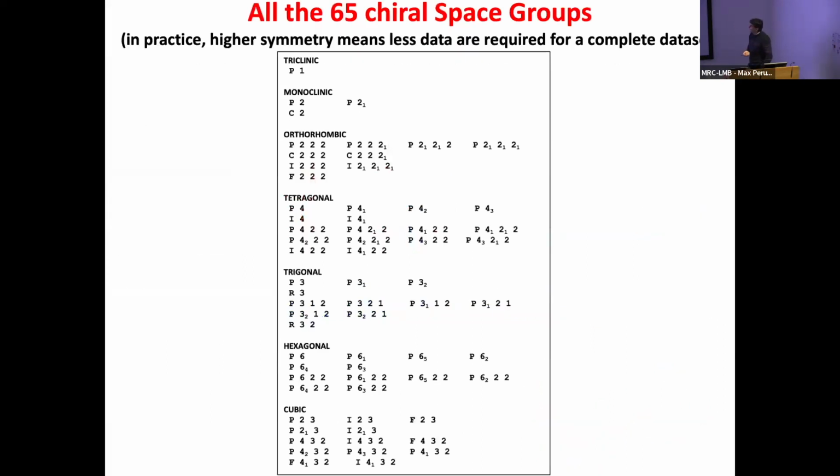These are all the possible space groups you can obtain with protein crystals. Unless it is a very, very rare, super rare special case, where people see some kind of pentagonal formation, in 99.9999% of the cases your crystal will be in one of these space groups.